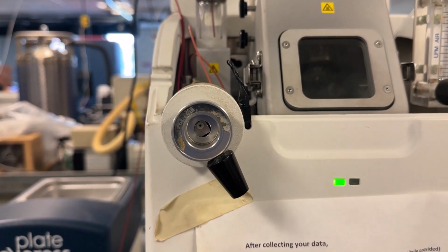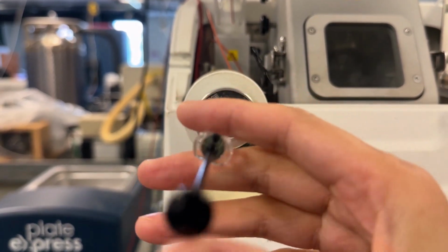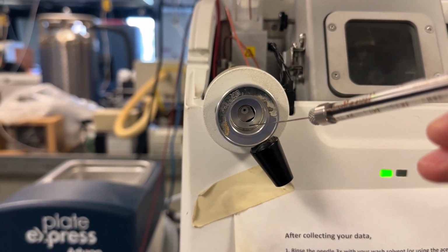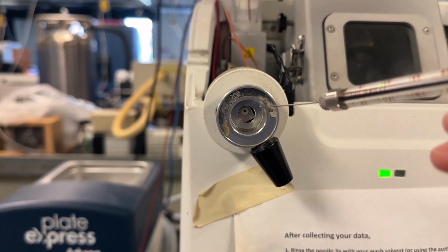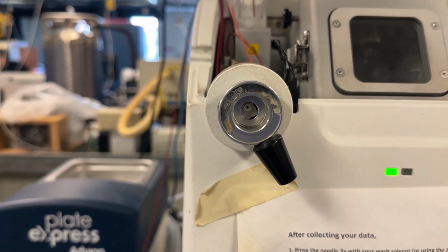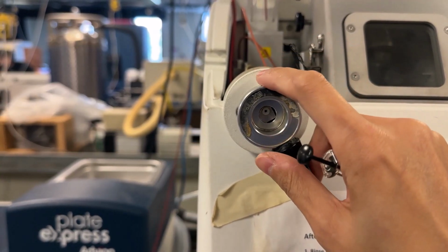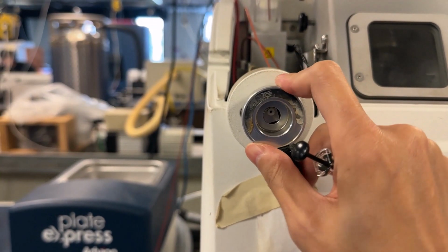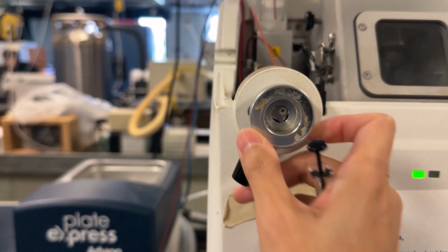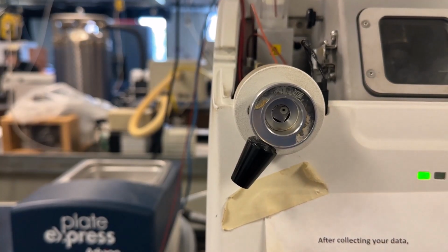With the injection port on load direction, facing 4-5 o'clock, put the syringe needle into the port and load the sample into the loop by pushing the plunger. Pull out the syringe. Notify RIC staff if there is any leakage. Inject the sample by switching the valve to the inject position, pointing at 7-8 o'clock. Wait a few seconds for the entire sample plug to be pushed through the sample loop and to the ion source. Wash your syringe 3x with solvent.